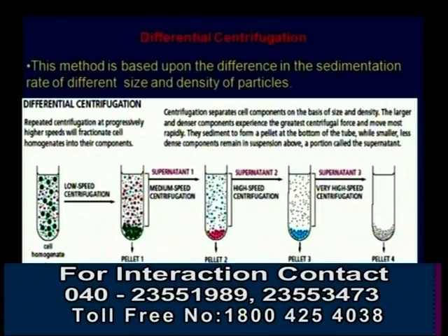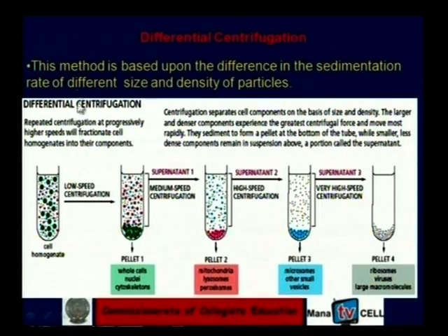Coming to the next slide, here, differential centrifugation. In differential centrifugation, the differentiation is mainly based upon the size of the particle and the density of the particle. As is well known, particles of larger density or larger size will experience more centrifugal force than smaller or lighter particles.